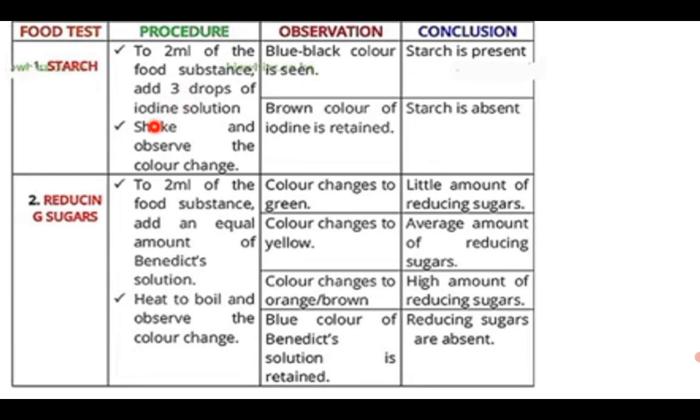Then you shake and observe the color change. Remember that your observations are based on color change. There are 2 possible observations.